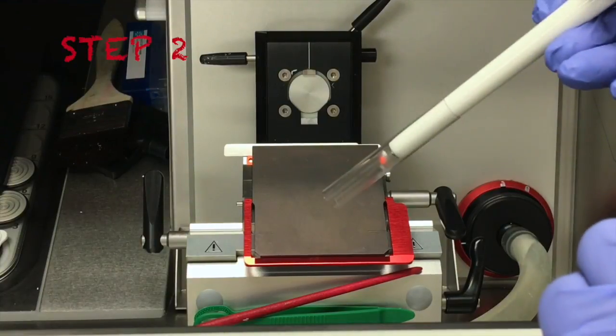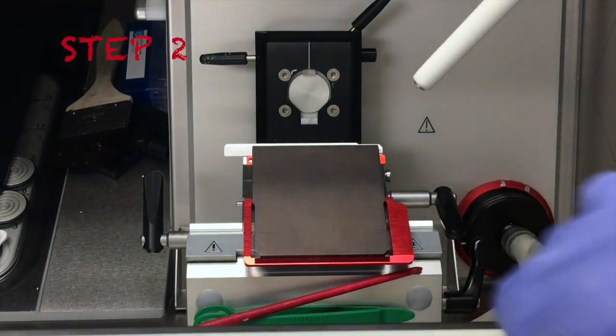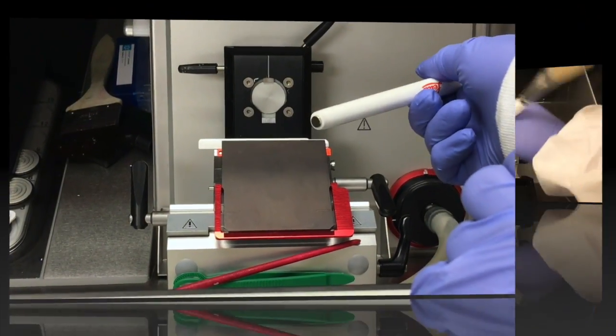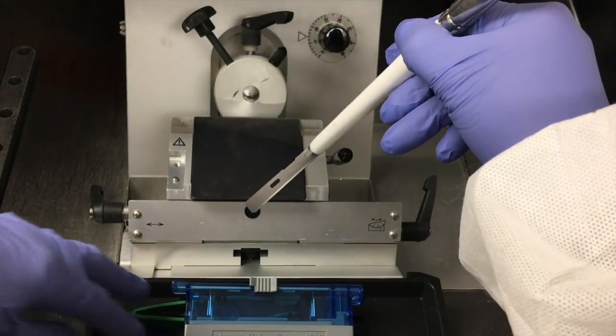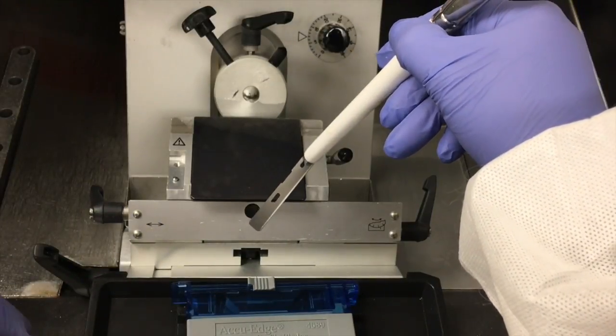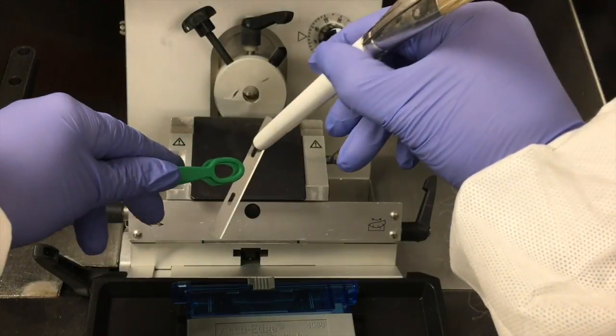Step 2. Now remove plastic magnet guard from the end of the Leica brush to expose the magnet. With magnet remove blade from behind the blade clamping plate. Use the green plastic forceps to separate blade from magnet.